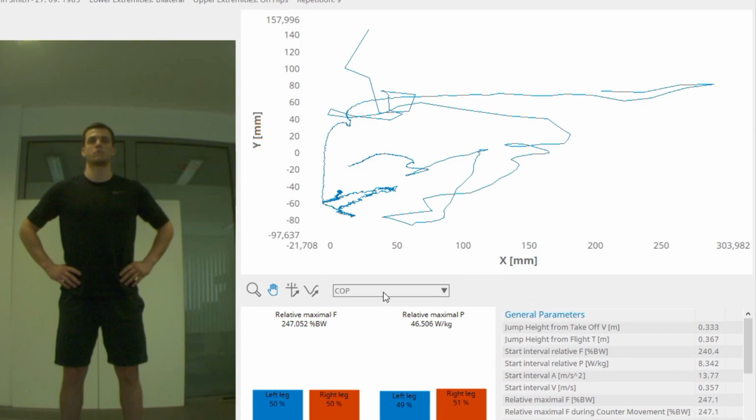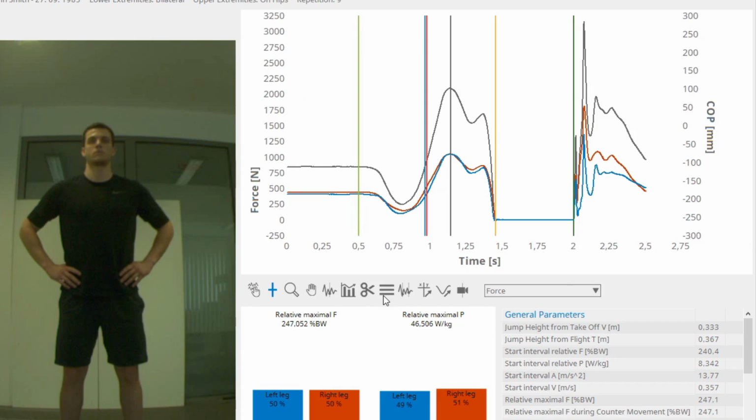There are some toolbox functions that help the user to easily manipulate data. Scissoring the data is not reversible. By clicking on the Legend button, you will get a legend on the graph that shows which color represents which signal.